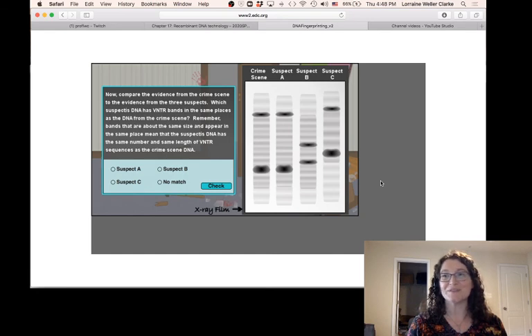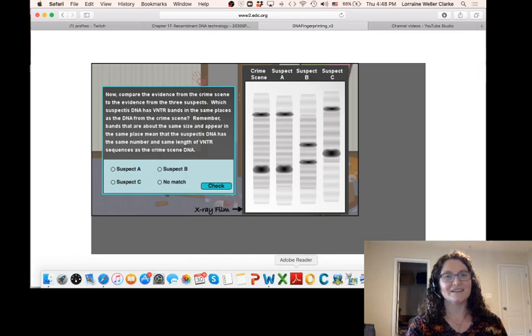Just write down which suspect did it based on what you just learned. I'm not going to press it for you. But your participation has been sitting through this interactive thing where you watch me do this instead of doing it yourself. Okay? All right. Again, bands that are about the same size and appear in the same place mean the suspect's DNA has the same number and length of VNTR sequences as the crime scene DNA.